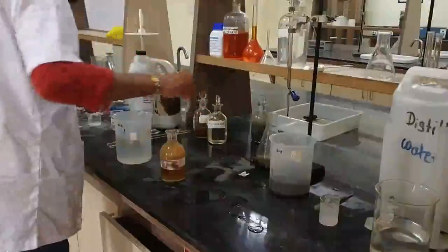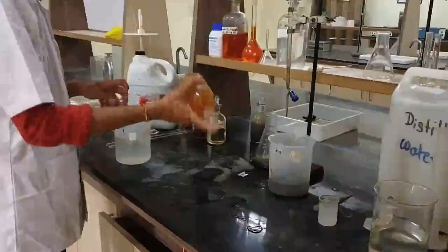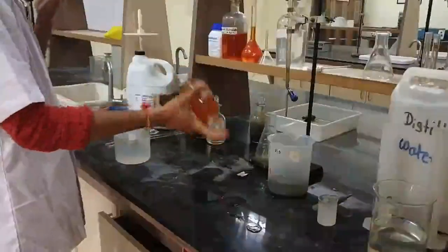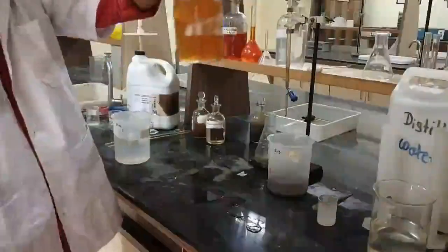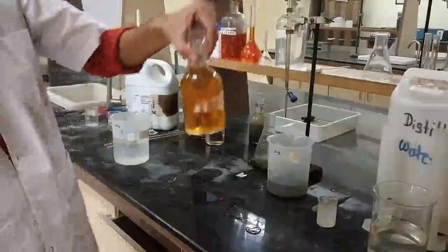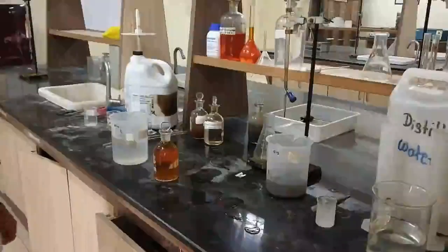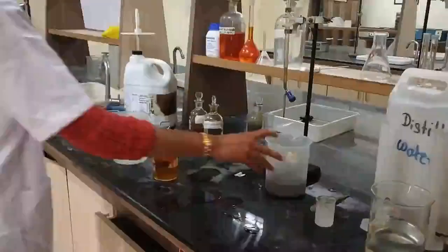We'll have to shake this bottle properly, and all this brownish PPT will get dissolved, and you will be getting a uniform yellow colored liquid. Yes, this is the uniform yellow colored liquid that you have got. And here at this particular juncture there is the process of free iodine liberation that is taking place.